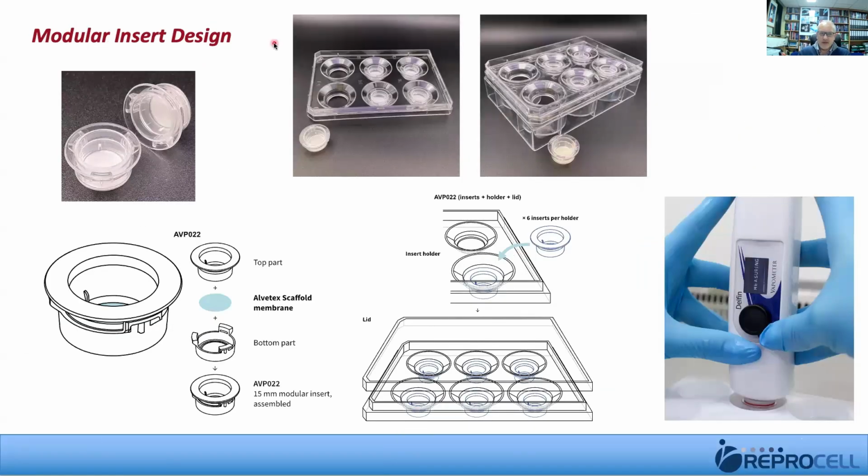These are the inserts again, as shown in this photograph, and what we see in the photograph on the right is one of the devices where we are interacting with the surface of the model. This device actually is measuring water loss from the surface of skin. That's used commonly in the cosmetics industry on real skin during clinical trials.